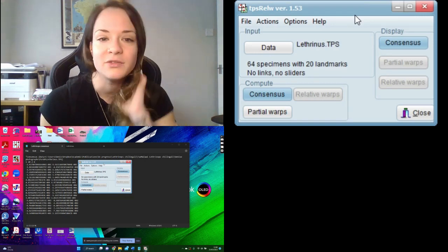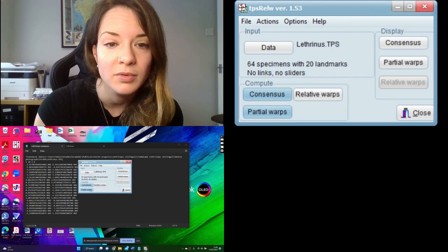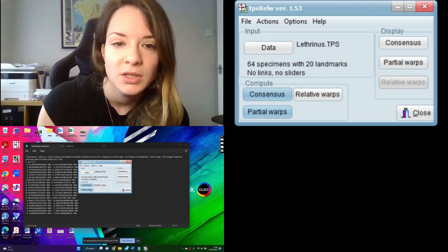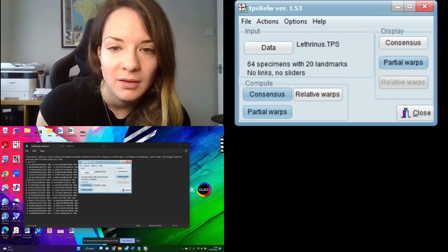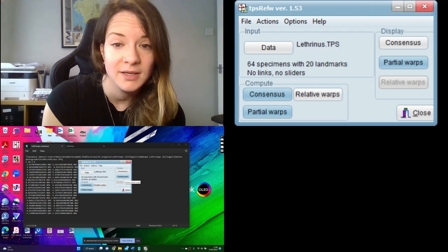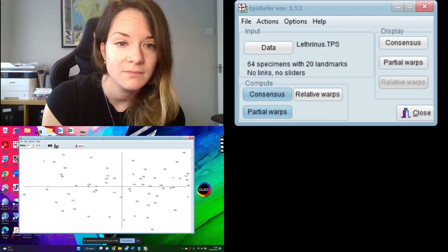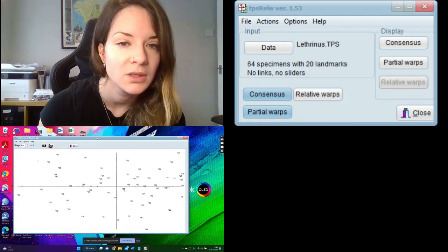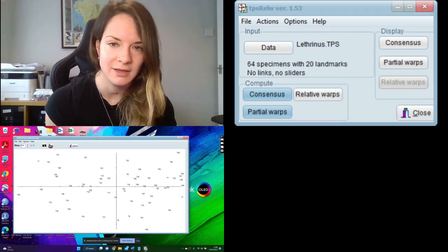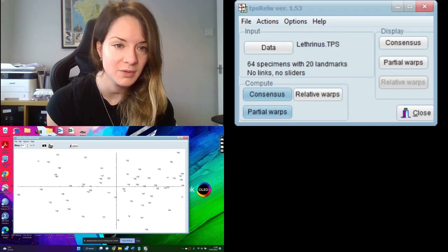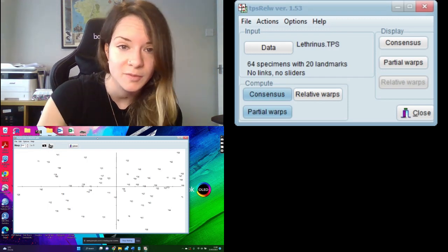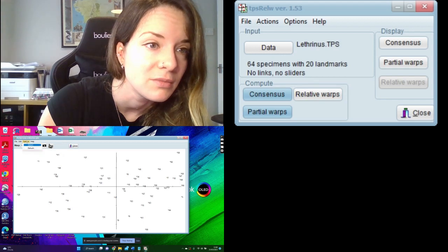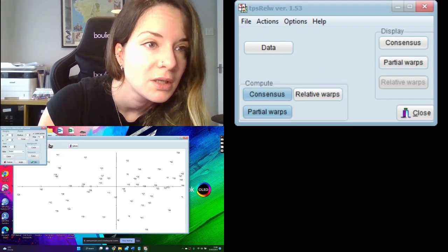So what we're going to do is we're going to do a partial warp analysis. So then we can display this as a partial warp ordination plot like this. So as you can see, it's basically a form of scatter plots.